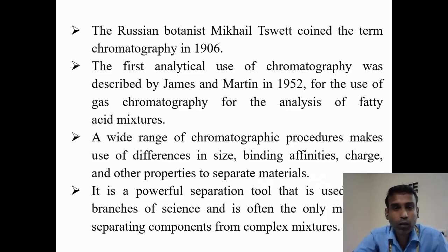Before entering into the chromatographic techniques, first we will discuss chromatography. The term chromatography was coined by the scientist Mikhail Tswett. The first analytical use of chromatography was described by James and Martin in the year 1952, for the use of gas chromatography for the analysis of fatty acid mixes. A wide range of chromatographic procedures makes use of differences in size, binding affinities, charge, and other properties to separate the materials present in the food products.